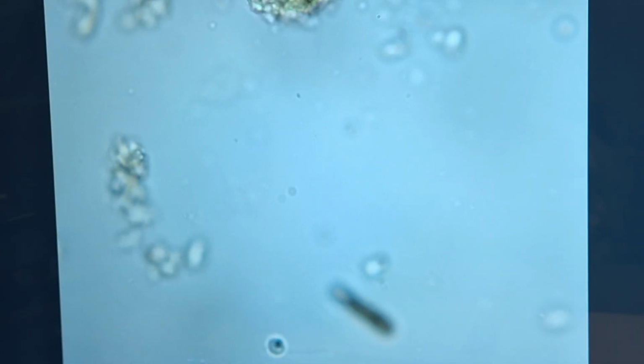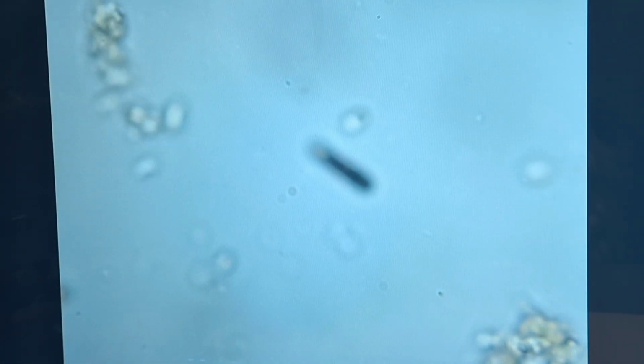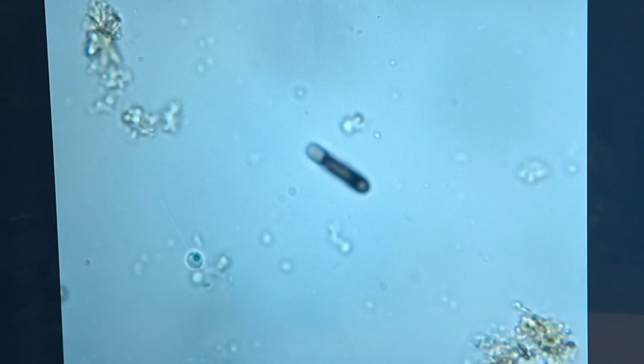That's again that protozoa layer level. Of the protozoa, there's 3 in that category we're looking for. The shelled amoeba and the naked amoeba. The flagellate, which we're seeing here, that has the one flagellum sticking out the back, whipping around or going in S's or circles. Sometimes that's the way it moves. Or if we see one moving through quickly and moving around very easily, that's the ciliate. And hopefully we don't see too many of those in here.